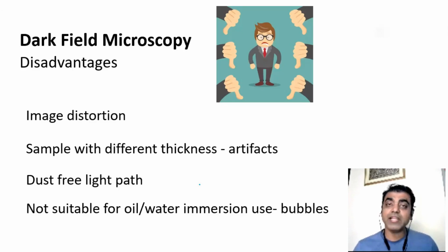And lastly, the dark field microscopy technique is not suitable for oil or water immersions. The one basic reason for that is you cannot avoid bubbles. The bubbles or the edges of the bubbles will cause a lot of diffraction of the light, and your entire objective of getting a sharp image against a dark background is lost.